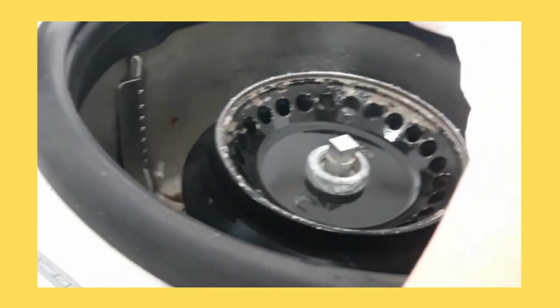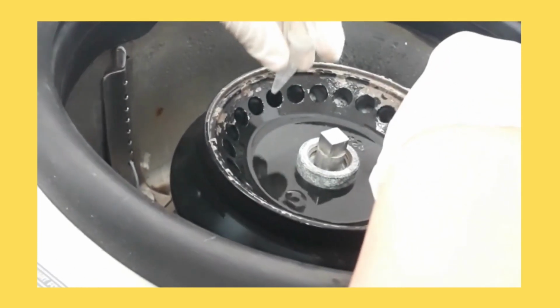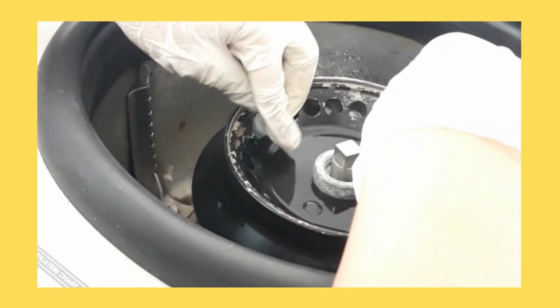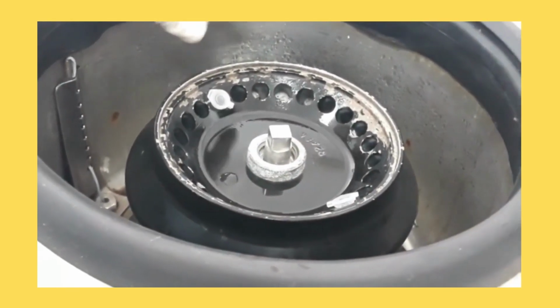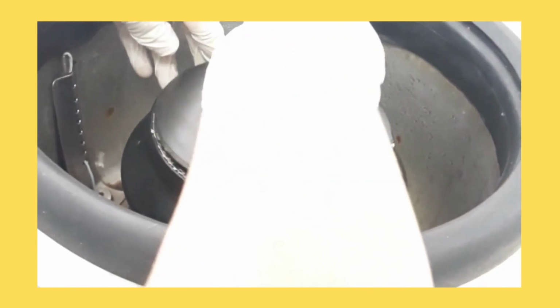Now centrifuge the microfuge tubes at 12,000 rpm for 15 minutes at 4 degrees Celsius. This centrifugation will help to separate the mixture into three phases: a red organic phase containing the protein, the interphase that contains the DNA, and the upper aqueous phase which contains the RNA.